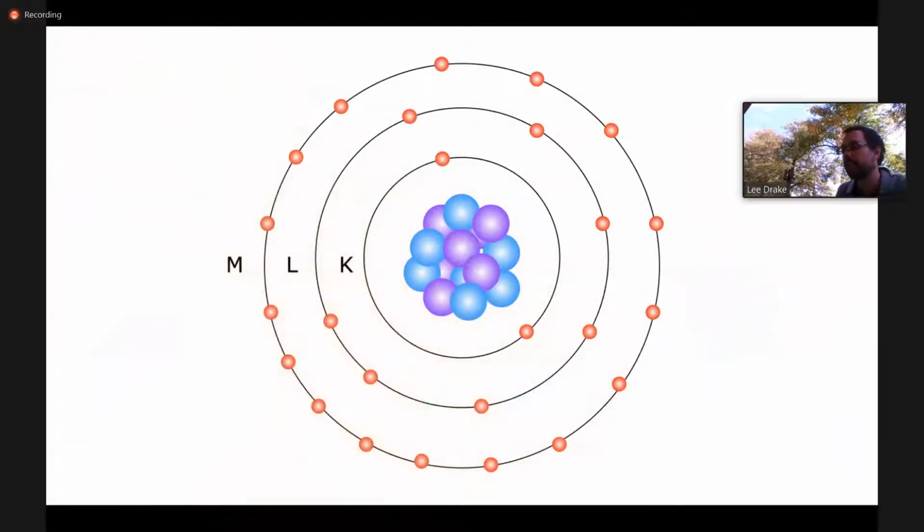So that is it. Now, some terminology, because as we discussed today in the workshop, we're going to be going over details of this process. So one of the first insider baseball terms you'll want to know is kappa alpha, or K alpha. This refers to an L shell electron moving in to replace an electron in the K orbital. So in this case, K is the destination, and alpha, Greek for 1, is how many orbitals removed we are.